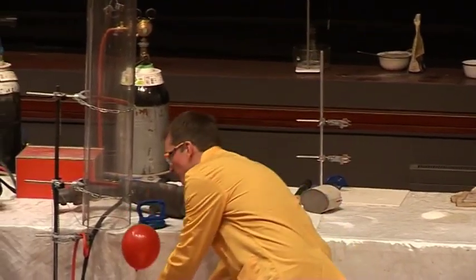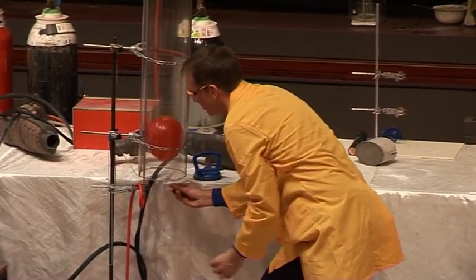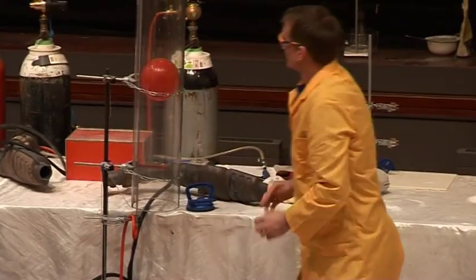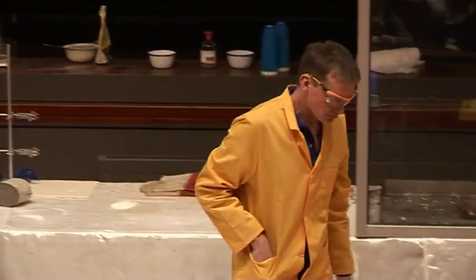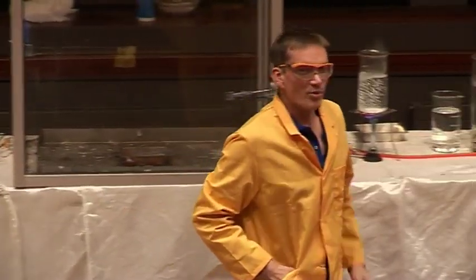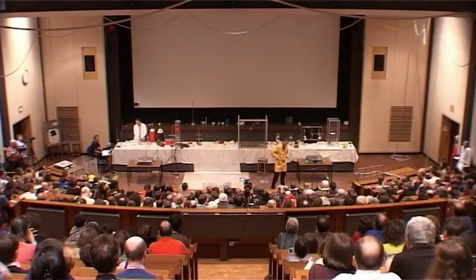I'm just going to put this one out the way. I'll put this up here to keep it safe in this tube. There we are. So that floats up nicely and just fits. That's handy. Almost as if we'd made it fit. Right. Okay, now we're going to have a look at some hydrogen.